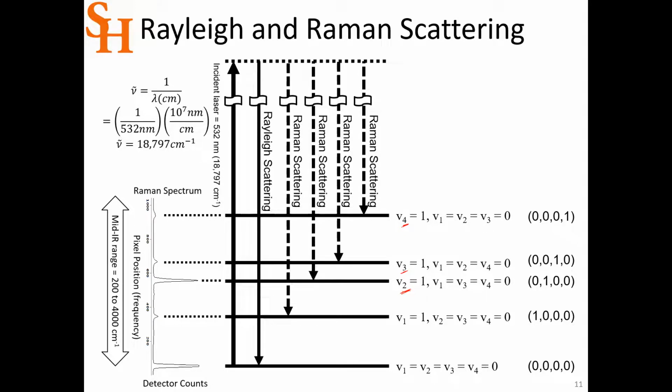And here's the IR spectrum for both. And so we'll have simulated and we'll have experimental spectra. We've got 8 spectra, okay? So we have the experimental Raman and IR, and we have the simulated Raman and IR for 2 molecules. And so we're going to do a stacked spectrum of all simulated and a stacked spectrum of all experimental.